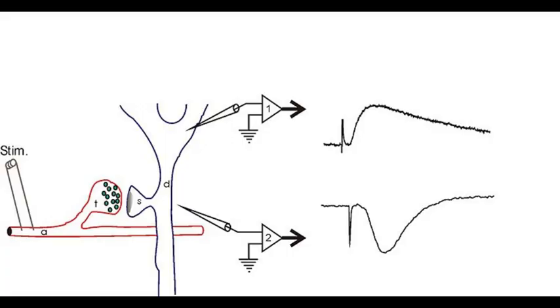In addition to recording intracellular electrical signals, we can use extracellular electrodes to monitor electrical activity from the outside. In this case, the polarity is reversed, since you are now measuring the drop in voltage caused by sodium flowing in and the increase in voltage caused by potassium flowing out. Extracellular recordings are useful for recording many neurons in deeper parts of the brain, where intracellular recordings are more challenging.